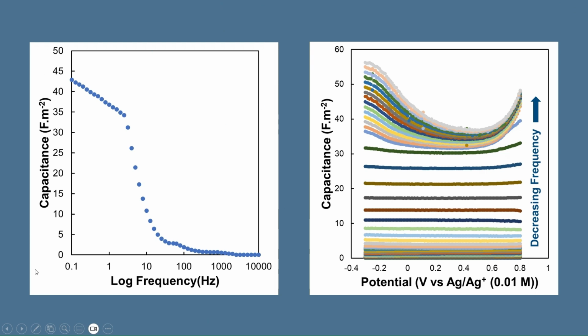So if you apply what we just talked about, you'll get some data that looks like this with your capacitance on the y-axis and log of frequency on the x. For this experiment, we did quite a few frequencies. I think it's very important to do that instead of focusing on a narrow frequency range. Otherwise, you're going to miss important information.